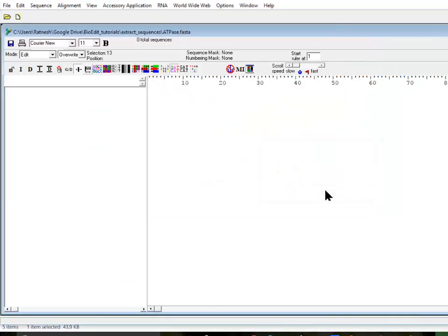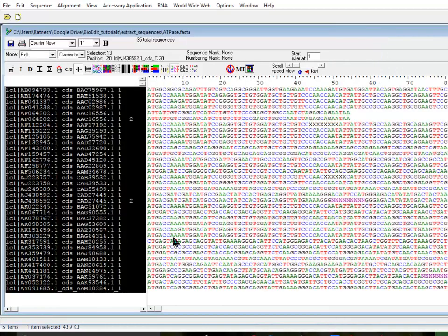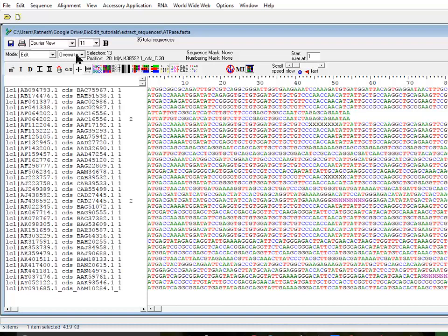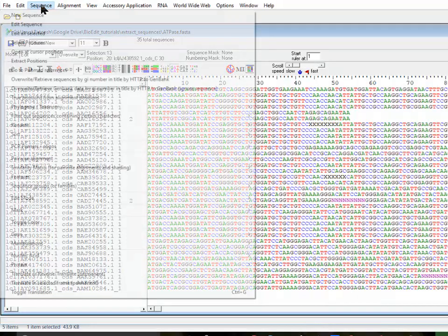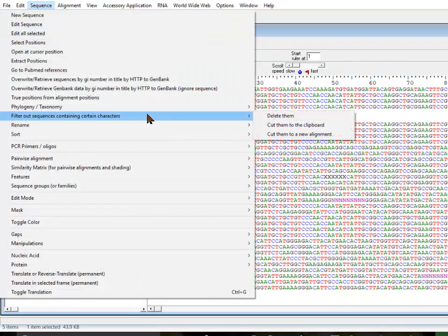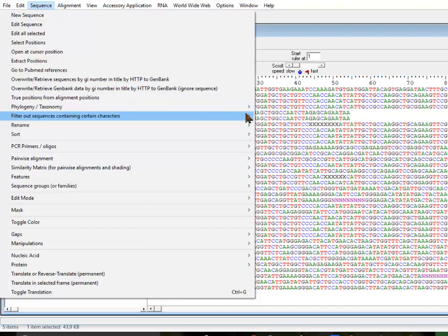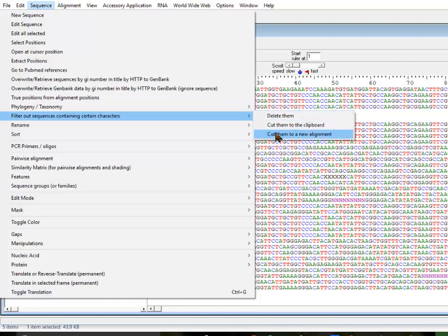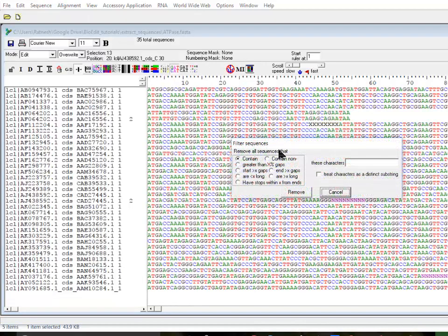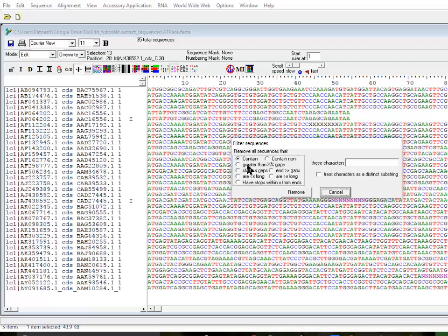I'm going to put it back all the sequences into the file. The other option you can do for filtering out sequences containing certain characters is based on percent of gaps.